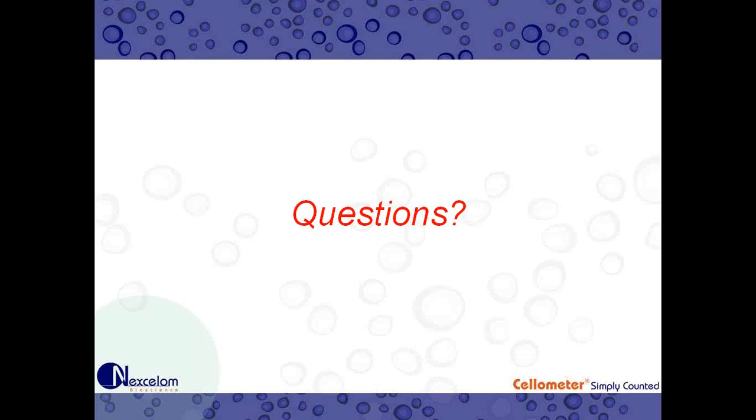We do have one question: what other instruments are optimized for small cells for counting and viability and things of that nature? We talked specifically about the X1, X2 today. Ben briefly mentioned the X4. Great question. The instruments that are optimized for small cell counting are the Cellometer M10, M as in Mary.